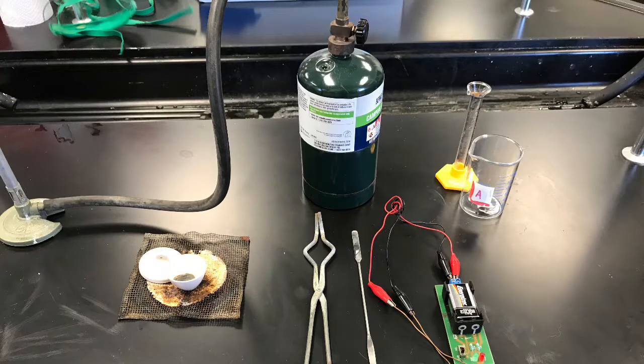We found out that we can identify an ionic compound when the product is not malleable, not lustrous, not conductive when dry, and conductive when wet. And now, here is our evidence.